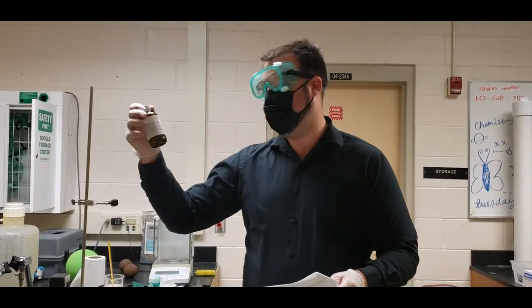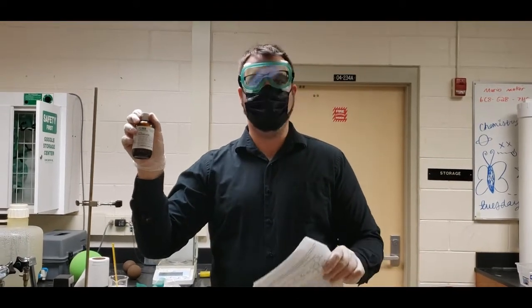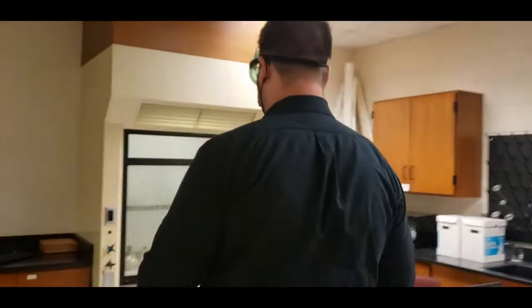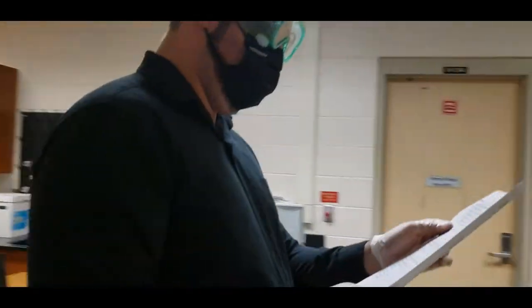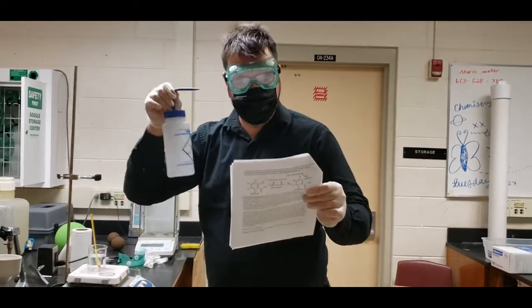We have sulfuric acid. This is 18 molar sulfuric acid. This has toxic fumes that if you breathe in, you will have a bad time. That will also go into the fume hood. We have to have distilled water, which we have right here.